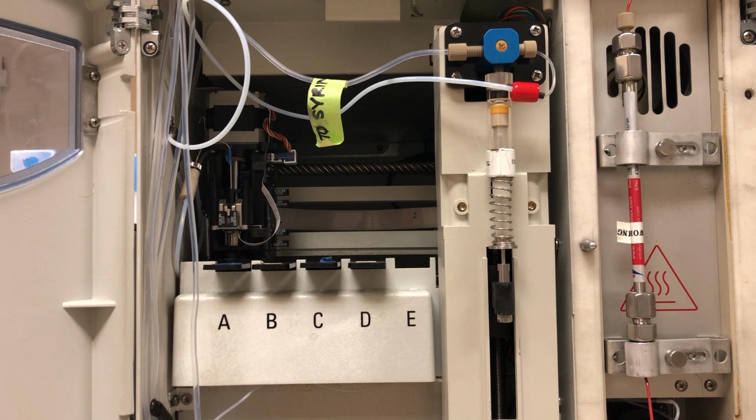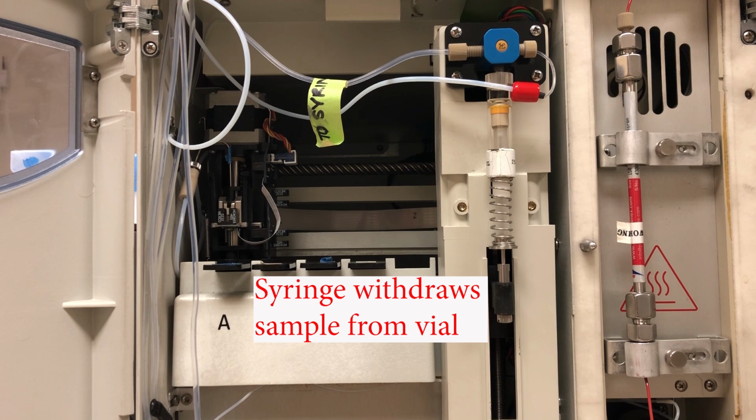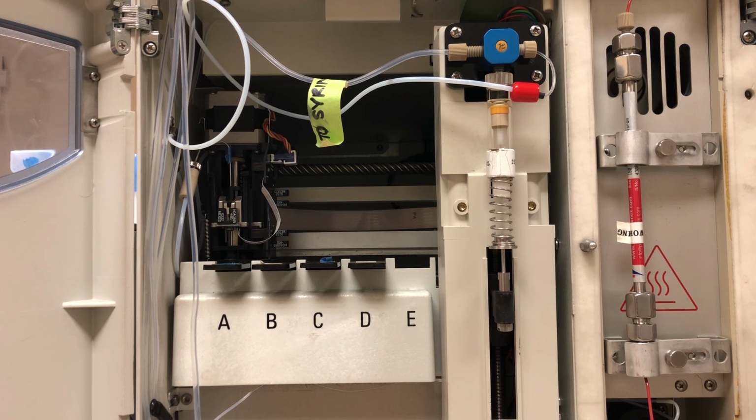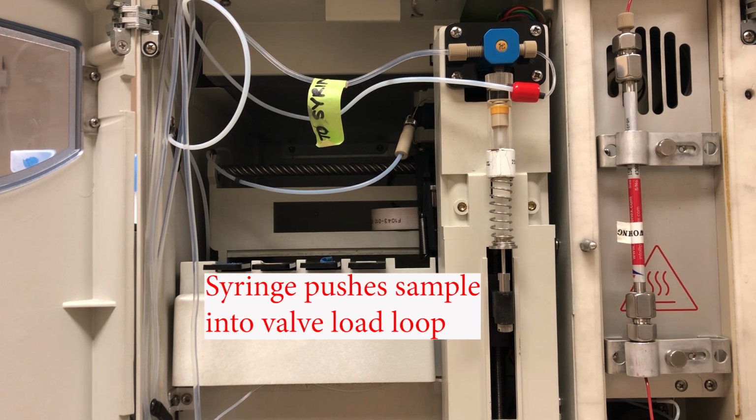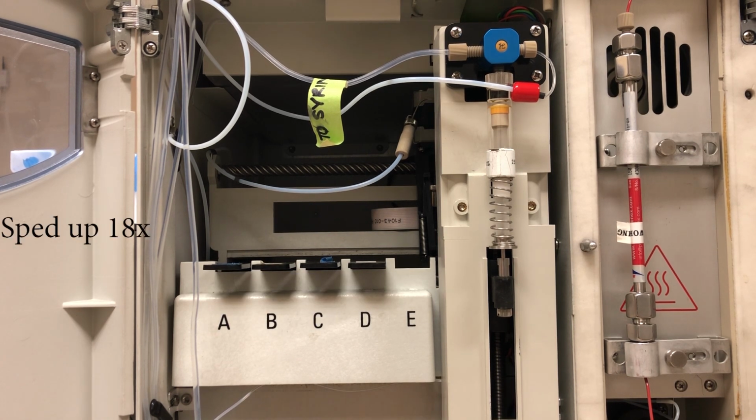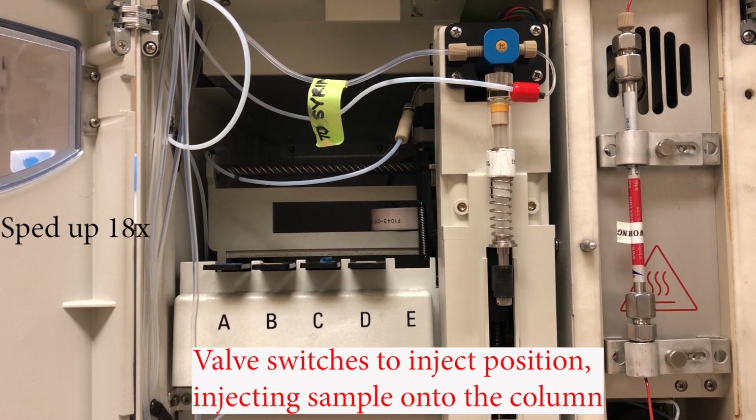And then our syringe, if you watch in just a minute, is going to pull down a little bit and pull some of the sample out of the vial. So that syringe is loaded with sample. Now, the needle connects to the sample loop, and the syringe pushes it into the sample loop, so it's loaded. Now we'll speed things up just a little bit. But once it's nice and ready, and it's go time, you actually hear it go bzz. It's a mechanical switching of the valve. It switches the valve to the inject position, and that pushes the sample from the sample loop onto the column in a nice tight band.